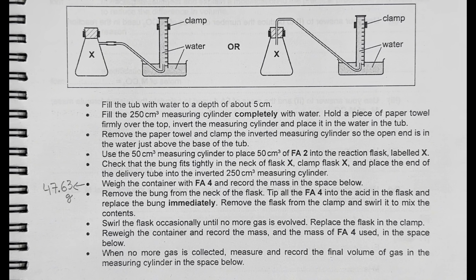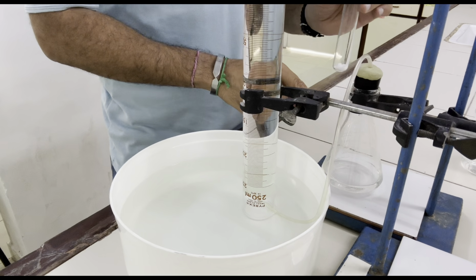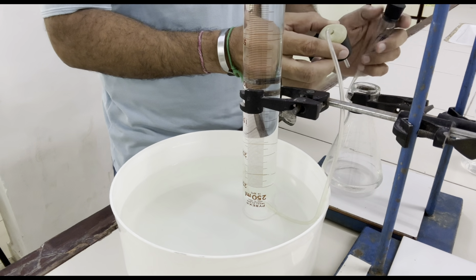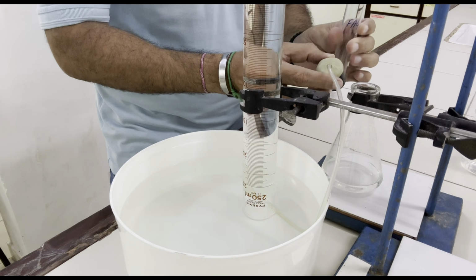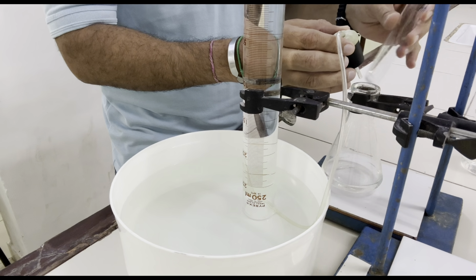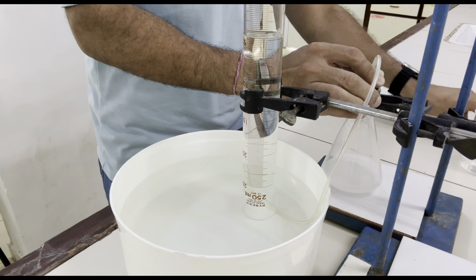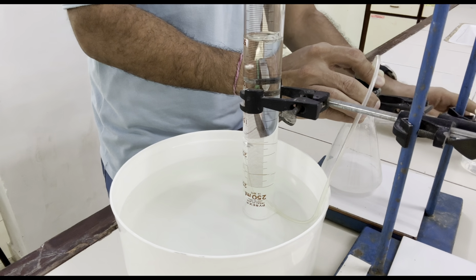So let's do it now. Now let's add this Fa4 into this conical flask. And remember, we have to replace this rubber bung as quickly as we can. So removing the rubber bung from this test tube, and now I will add it, and keep it pressed a bit so that there must be no loss of gas from the sides.